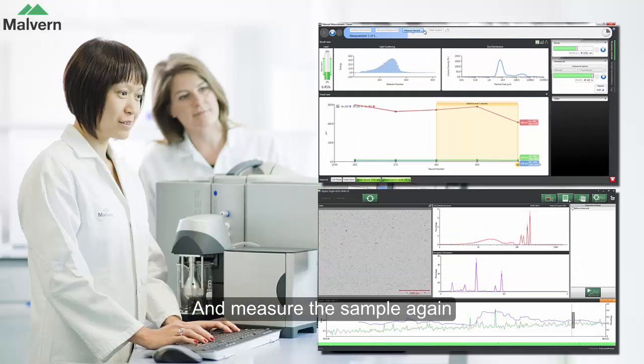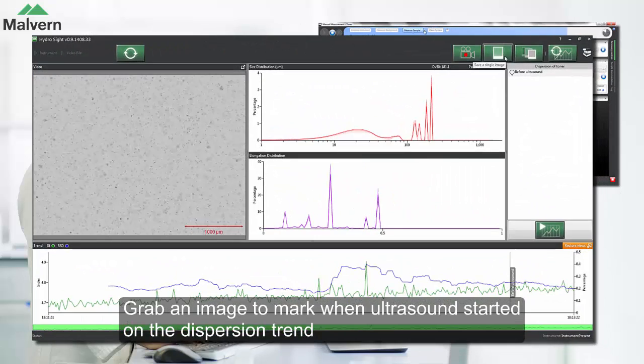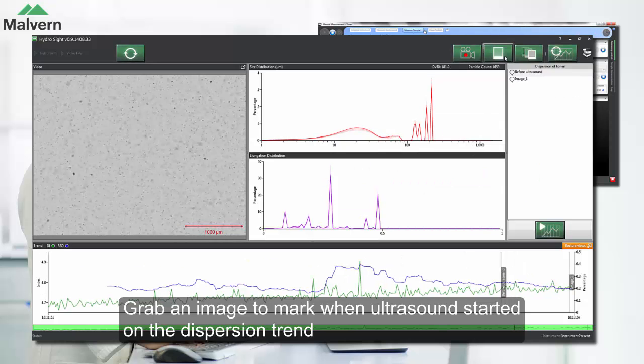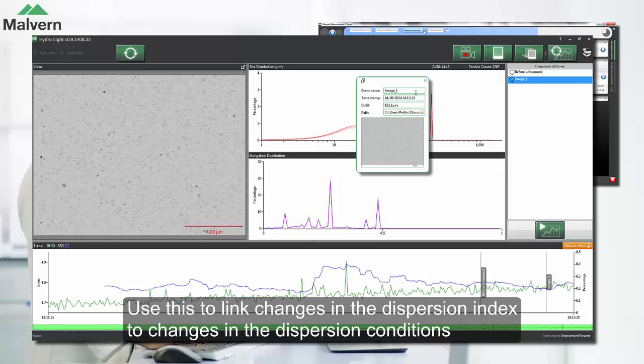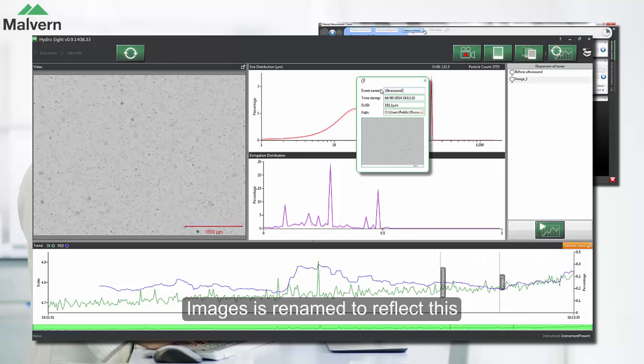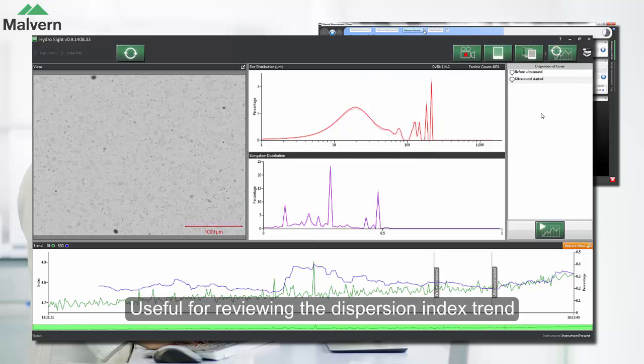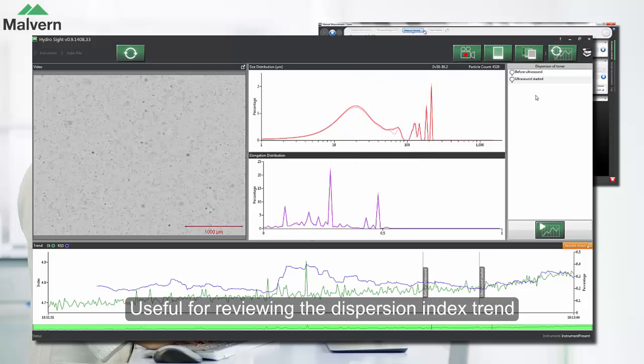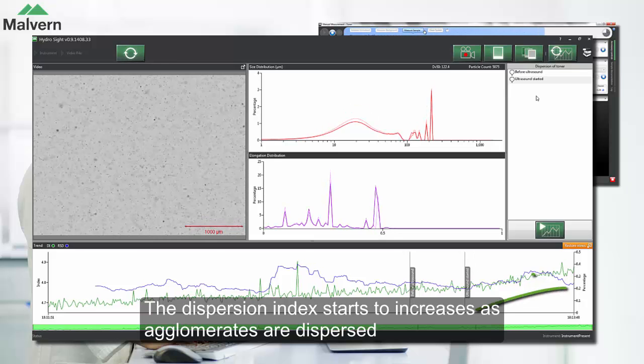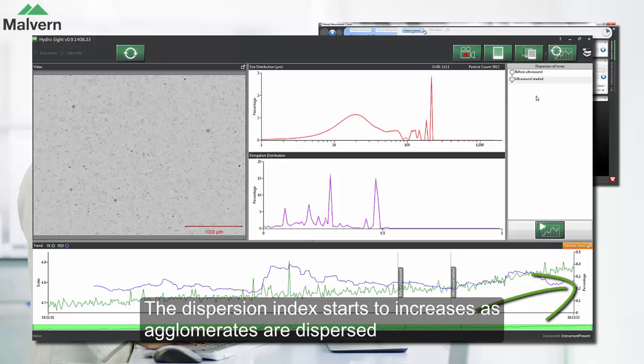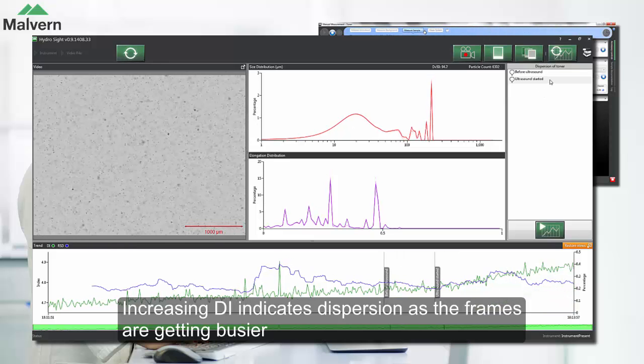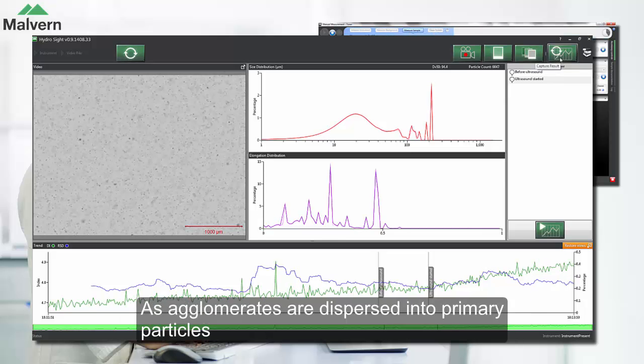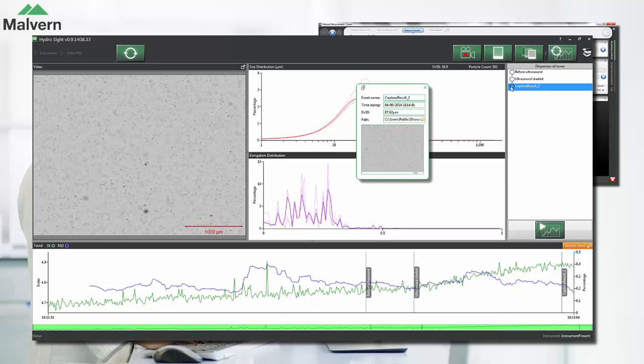Back in the HydroSight software we can take an image to mark when the ultrasound was turned on. This way we can link any changes in the dispersion index to changes in the dispersion conditions. The captured image can be renamed to show that this is when we turned the ultrasound on. This will be useful when we go back and review the dispersion index trend chart. We can already see that the dispersion index is starting to increase as agglomerates are dispersed into primary particles. An increasing dispersion index suggests dispersion as it indicates that the frame is getting busier.